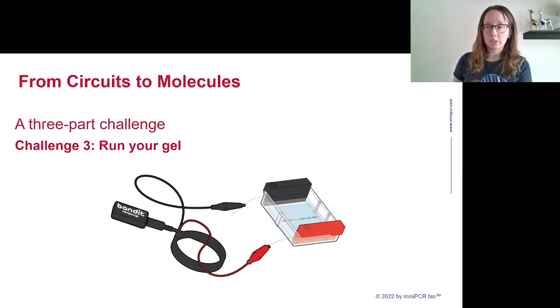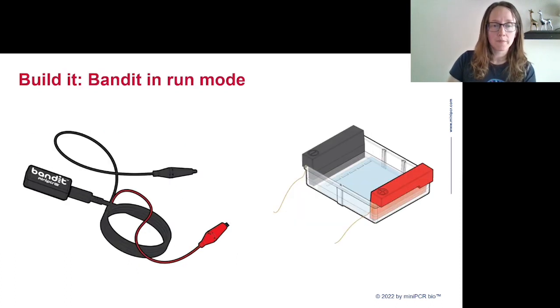We've laid the foundation for understanding electrophoresis. Now in this challenge, we're going to tie it all together and integrate the gel we just made into our circuit and start running our samples. We're going to switch our system from casting mode into run mode. Cooking show style, I have a ready-to-go gel here. Let's take that out and then I'll show you what it looks like when we flip Bandit into run mode and turn the system on.